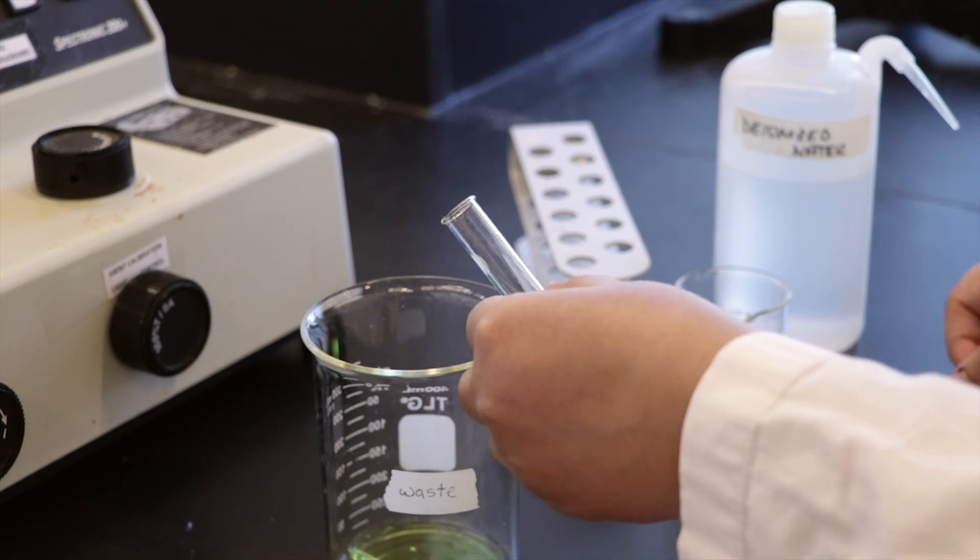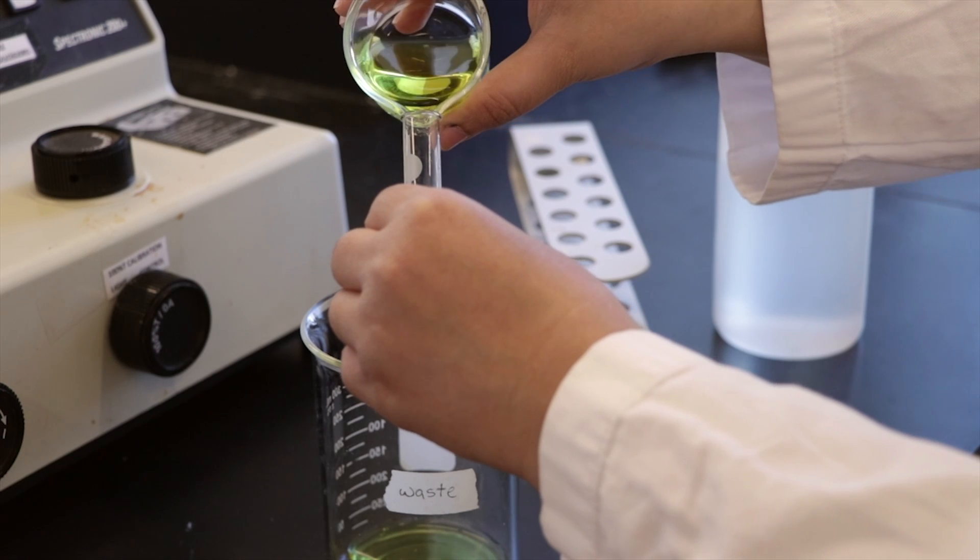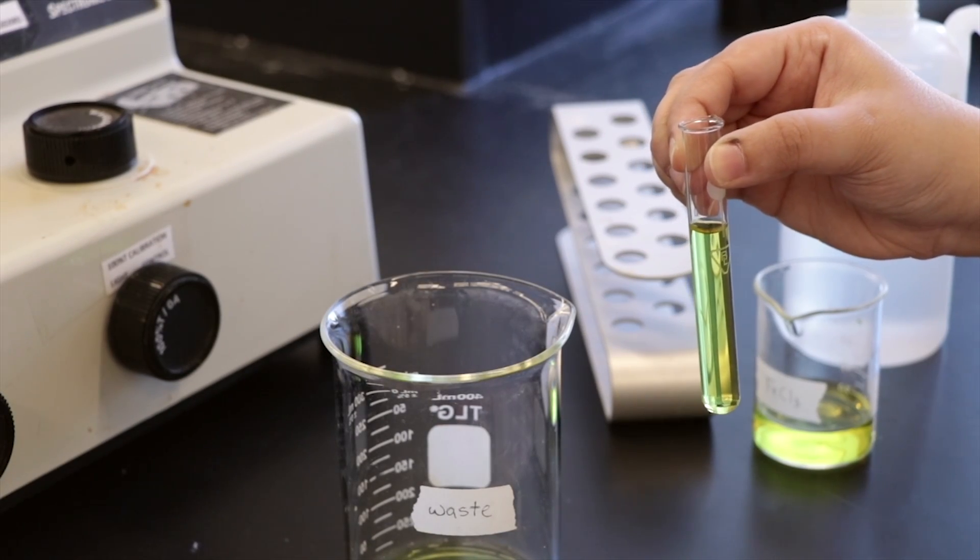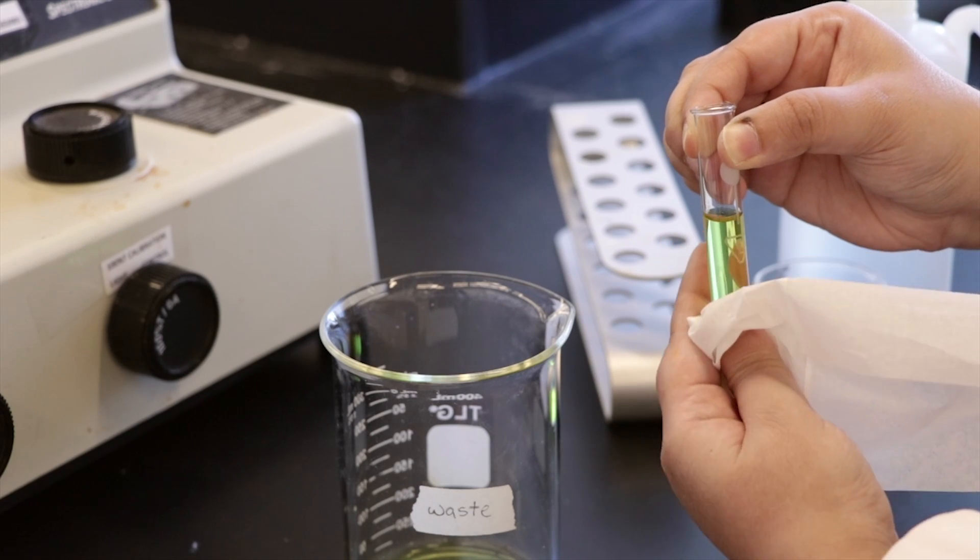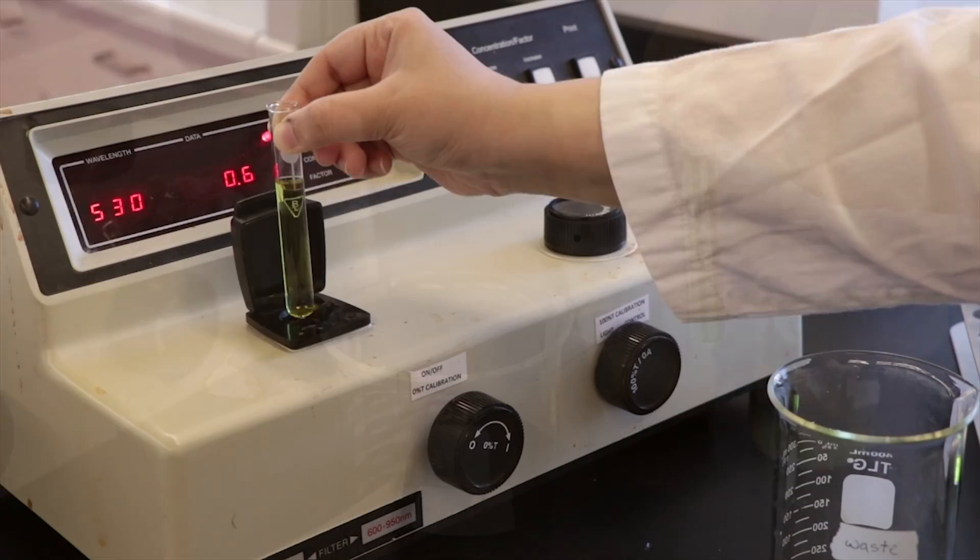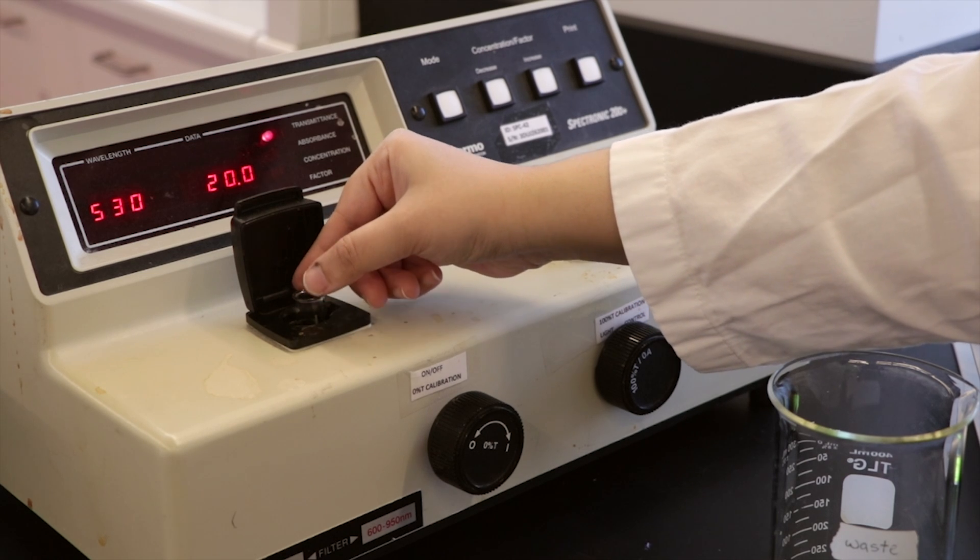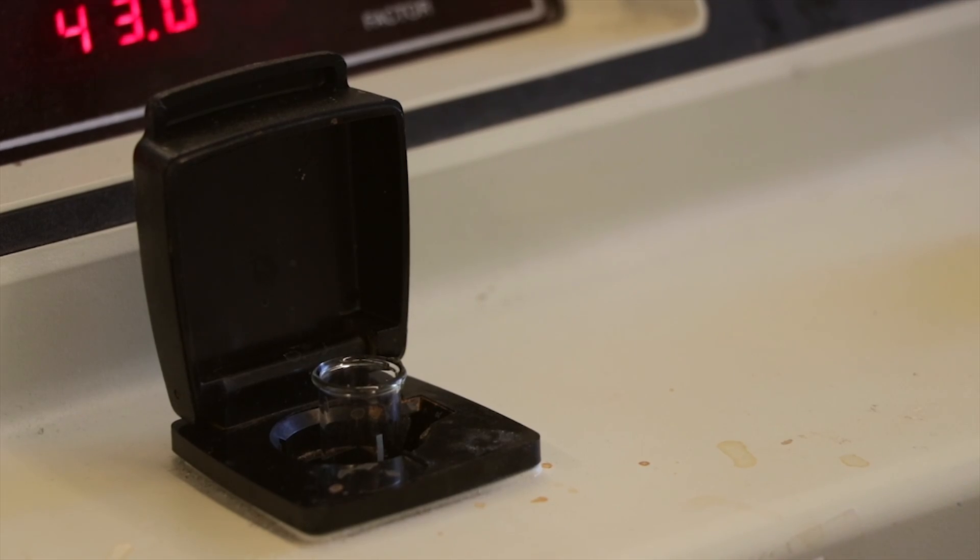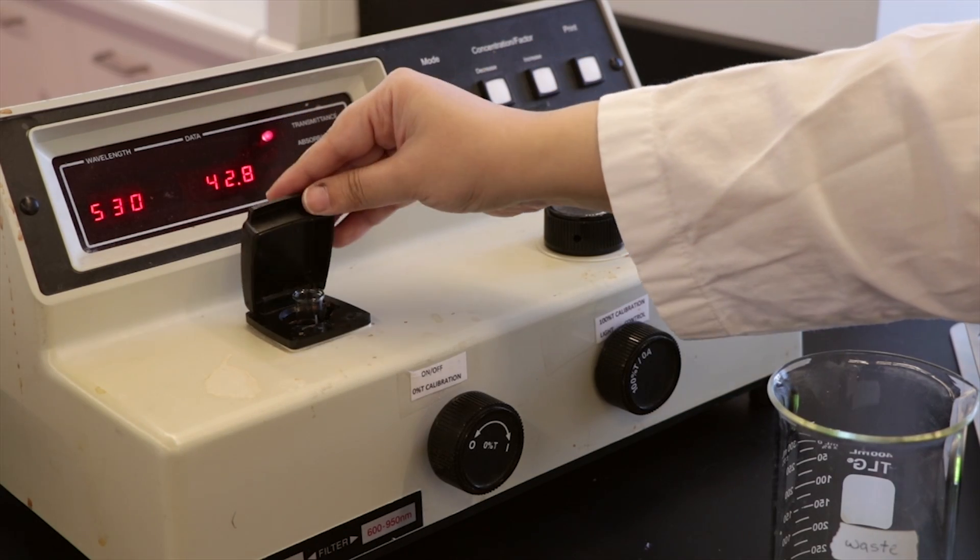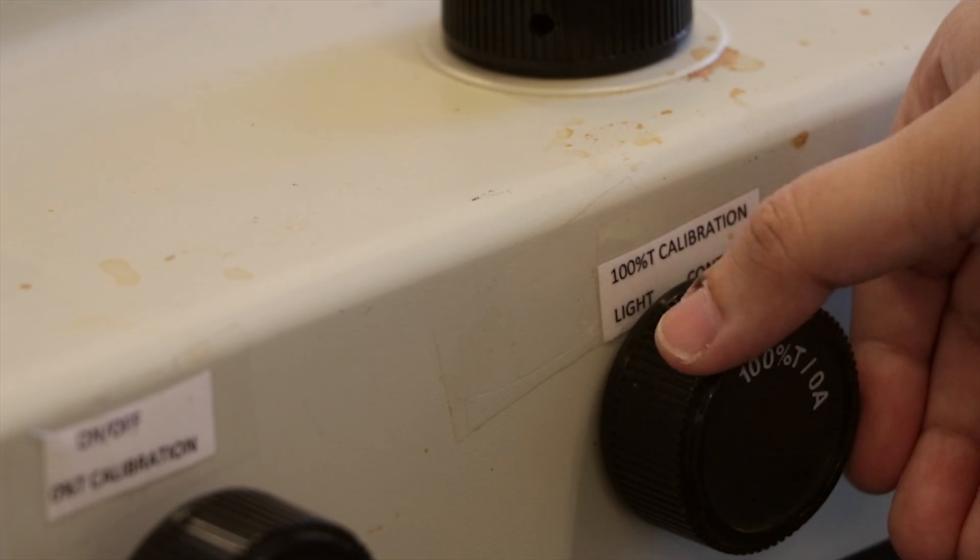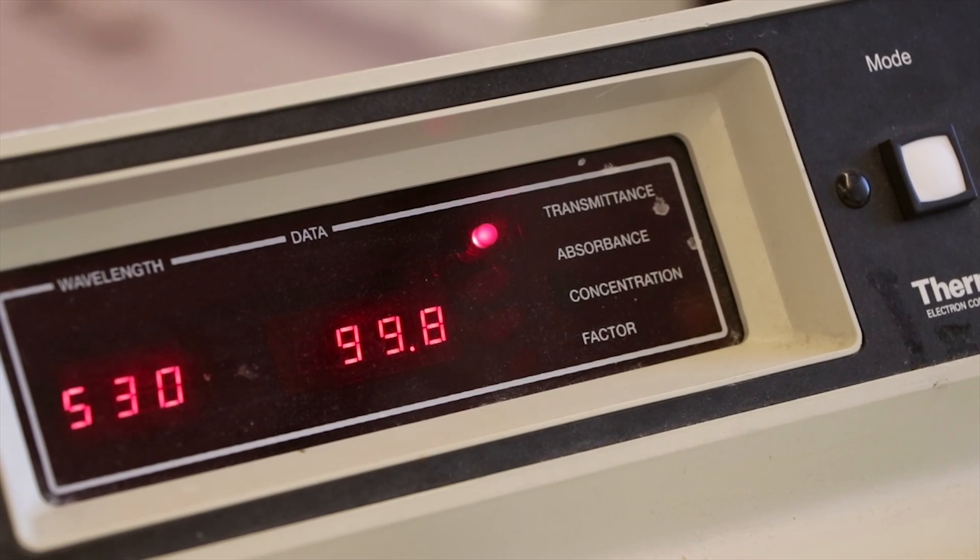You will use the FeCl3 to set 100% transmittance before analyzing your samples. Fill the cuvette to about two-thirds of the cuvette height and wipe the outside of the cuvette before placing it in the cuvette holder. Make a note of how the cuvette is placed in the holder. It should face the same direction for all subsequent readings. Close the lid and use the right dial to set 100% transmittance.